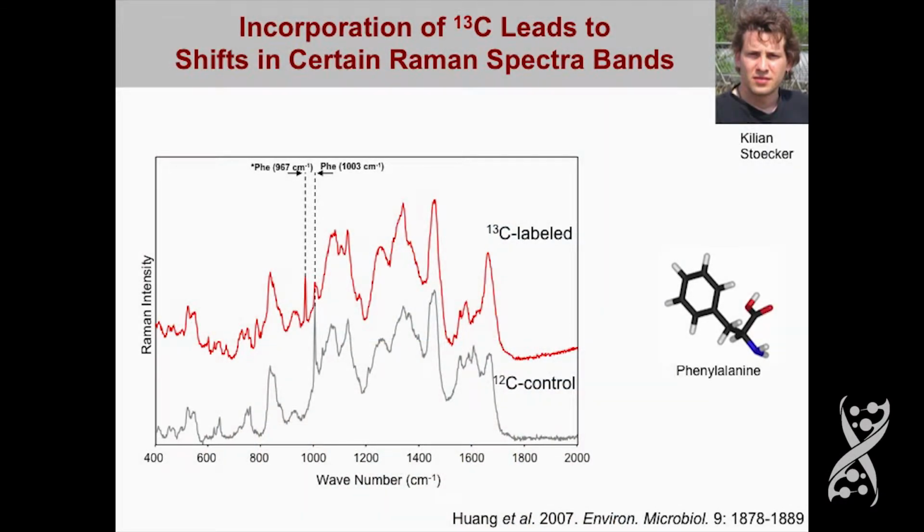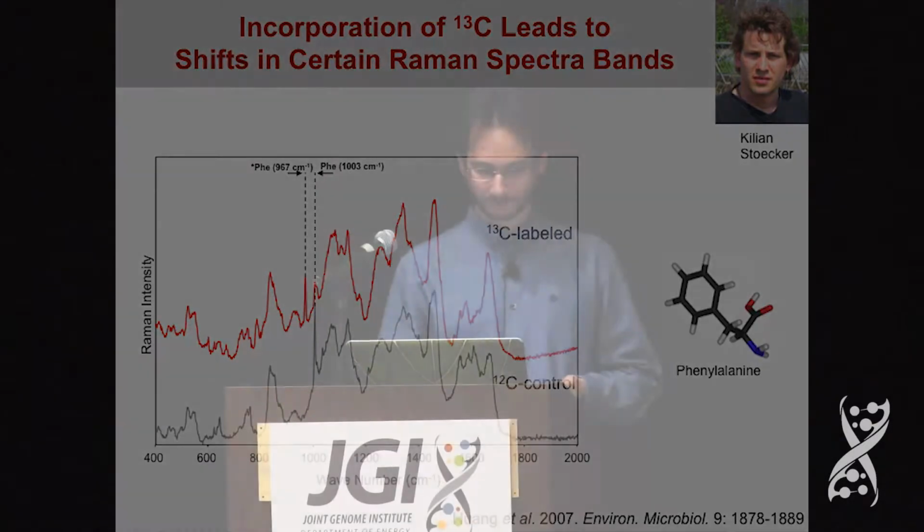But of course, you can utilize other compounds which have 13C or deuterium labeling them, and what the organism can degrade and build into its macromolecules, and then you will have other shifts in other peaks. But these labeled substrates are a bit expensive, so we went on to test the possibility to apply deuterium oxide, so heavy water, to label cells.